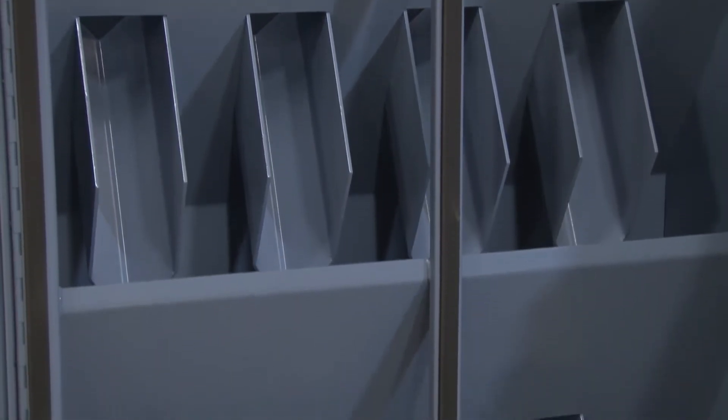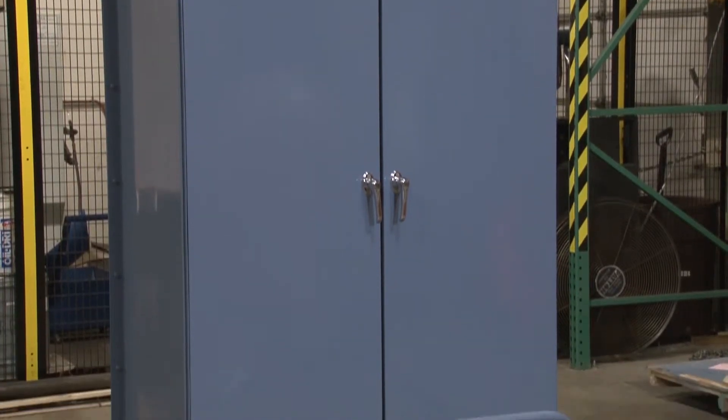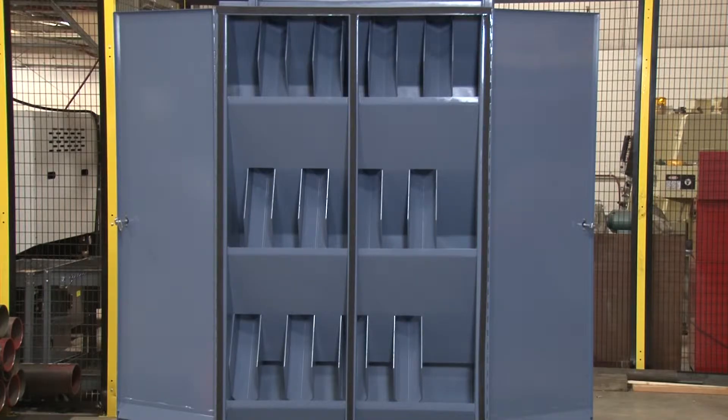The chutes are constructed of heavy welded steel, and the front panel doors assure superior dust control and swing wide open for easy cleaning.